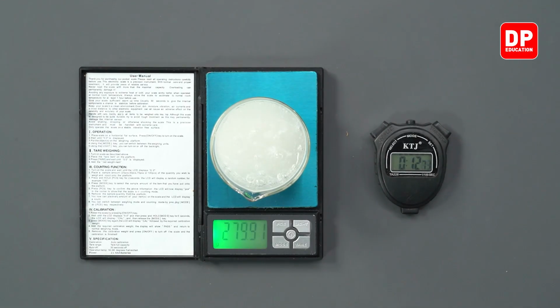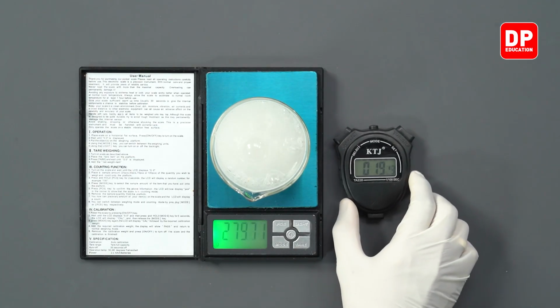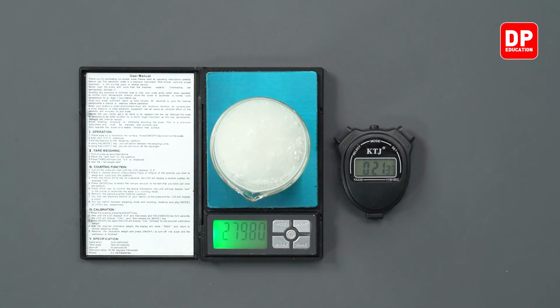So the first reading is going to be 279.80. 279.80 was our first reading at 20 seconds. Second reading would be 279.50.